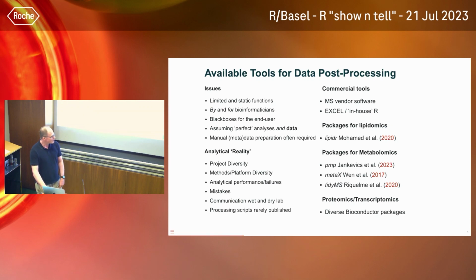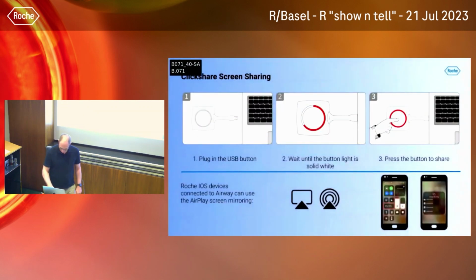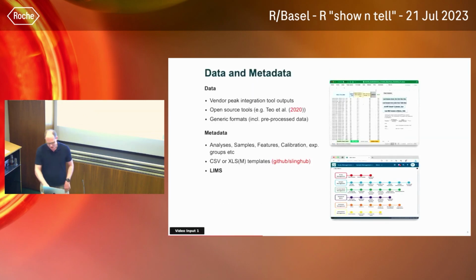So then, what do we do? First, a little bit about the data that we have. There is the metadata, and first of all the raw data that I showed, which is processed by another software.